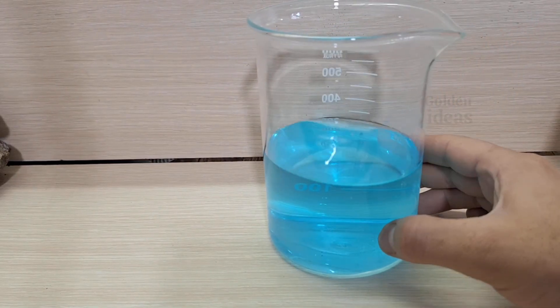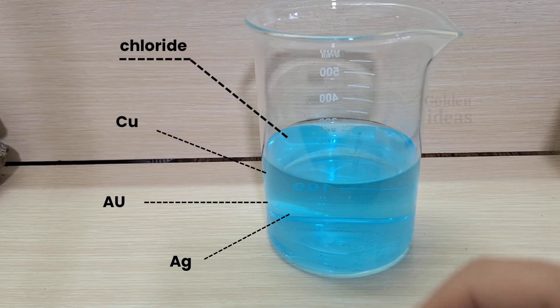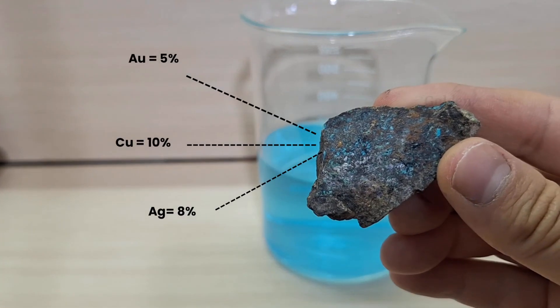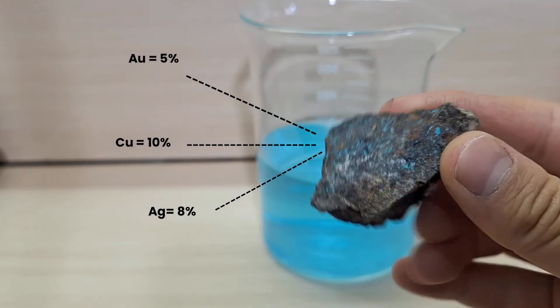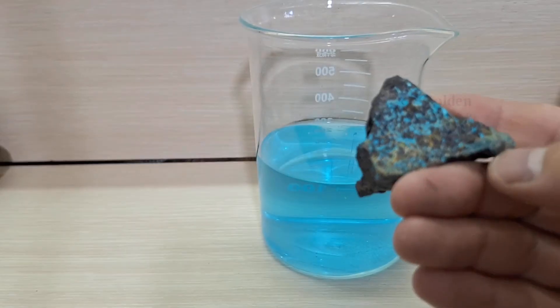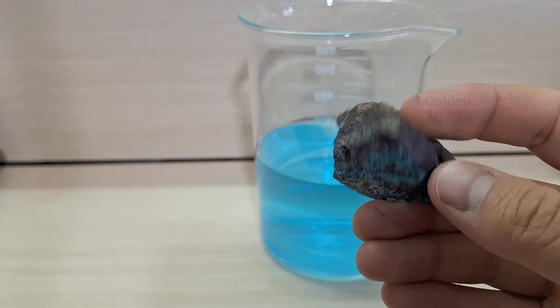Hello dear friends, I hope you're all doing well. Previously, I made a video about extracting gold using the electrolysis method. Some of you asked whether using graphite as both the anode and cathode could still result in gold deposition. So today, we're going to test that and find out together.